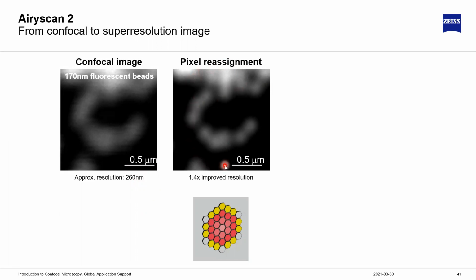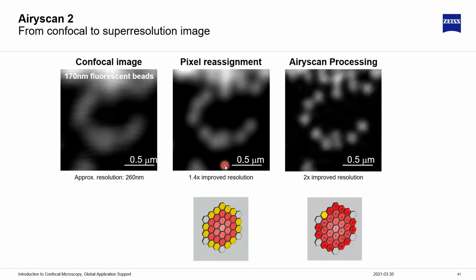I already get improved resolution. And now if I do the last step of Airyscan processing, so I process each of these images, I get, compared to the confocal microscope, 2 times higher resolution with the Airyscan detector.